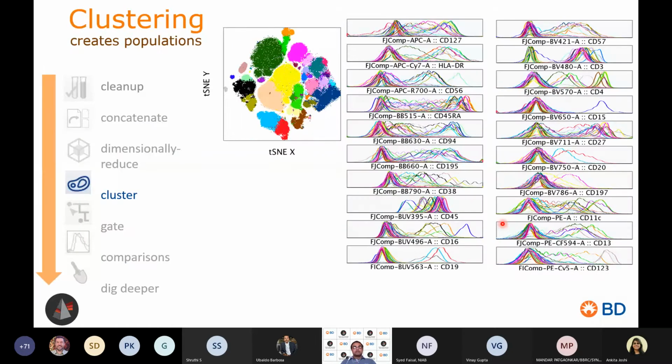Now coming to clustering, these are basically your FlowSOM clusters. There are different options of doing clustering: FlowSOM, PhenoGraph. PhenoGraph is a good one, that's my favorite. But in terms of ease, X-shift is also pretty easy. It does not require R even.